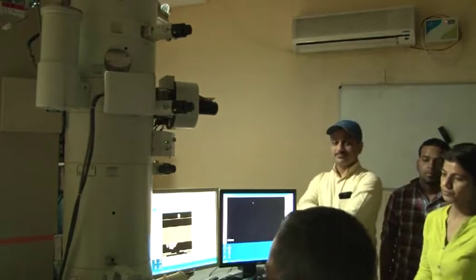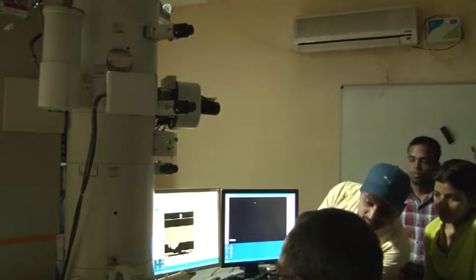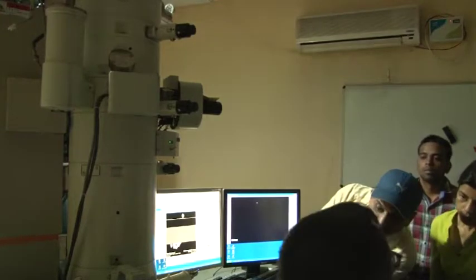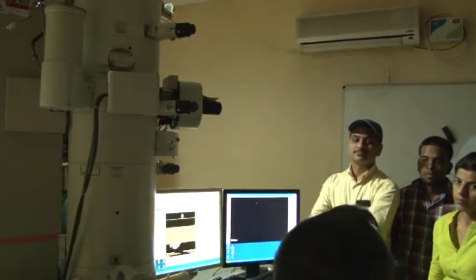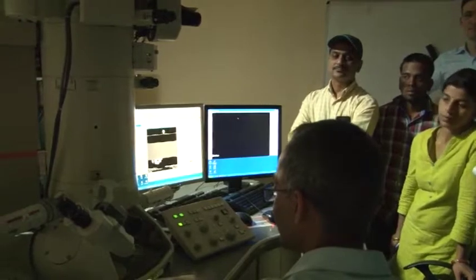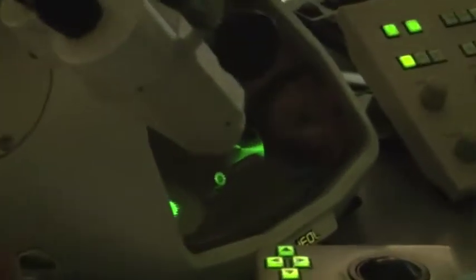And now we see how it behaves. I have now centered it, and you see this was indeed too much that I had done. So when I now come to focus, you see it is going in. Now, if I succeed in centering it, then we should say that we have learnt very well how to center, because it is quite significantly misaligned.